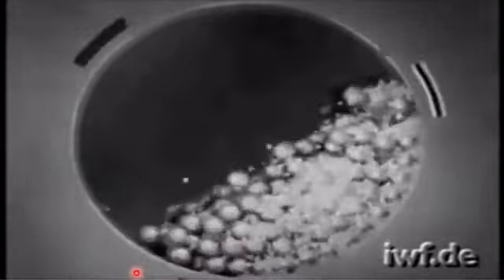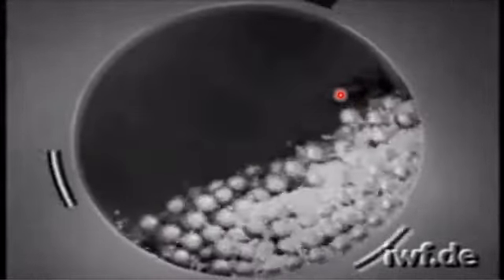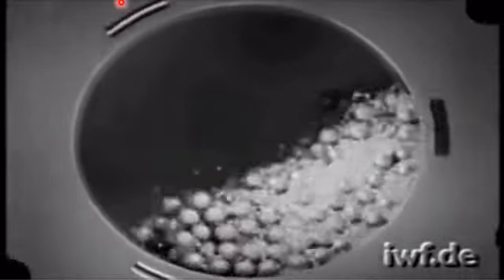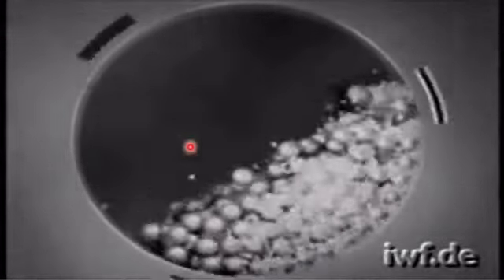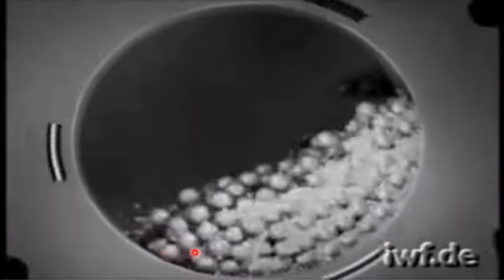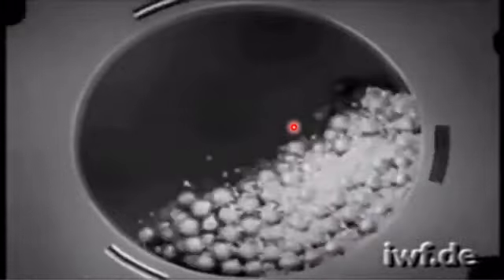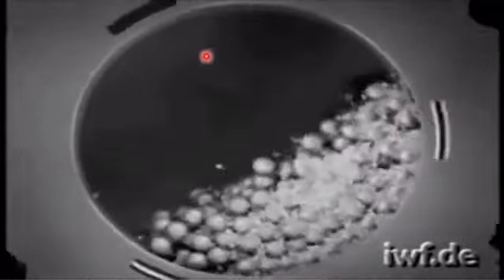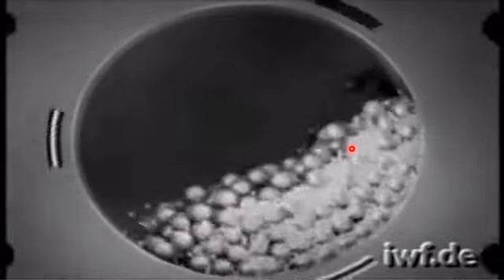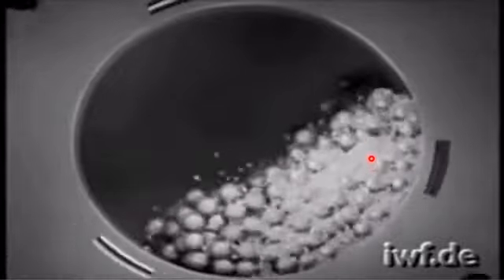As you know, in a ball milling instrument there are hard or soft or different types of balls used inside the hollow cylindrical region. These balls may collide with the surface of the hollow part of the ball mill, which may create an impurity inside the hollow part in which the nanopowder is crushed. So they may cause impurity in the nanopowder.